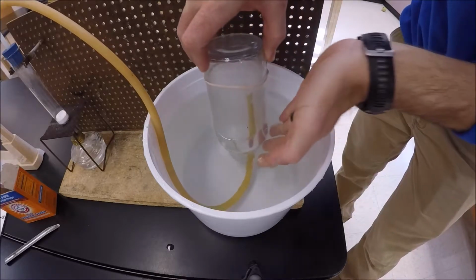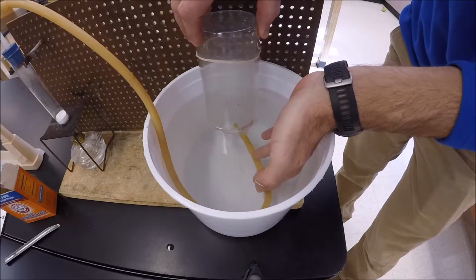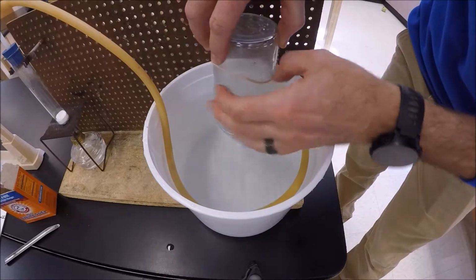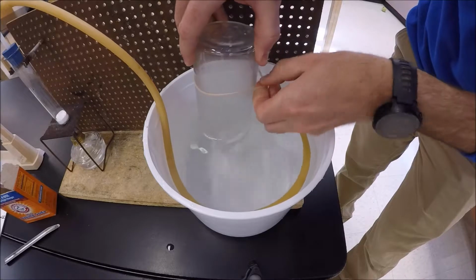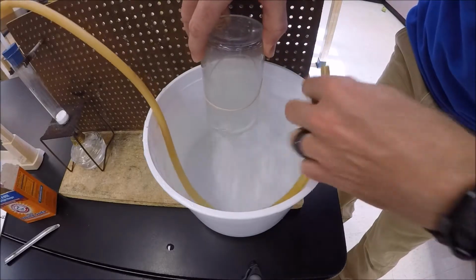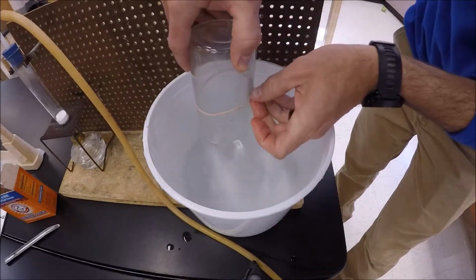I'm going to lift, but I cannot lift the bottom of the jar out of the water. I'm just going to remove the tube, and I'm going to slide this rubber band down. The rubber band actually becomes my marking device. So I'm going to mark the level between where the water meets the gas.